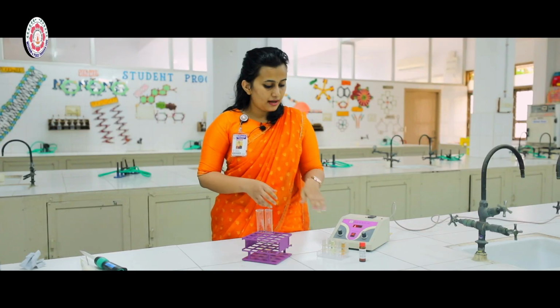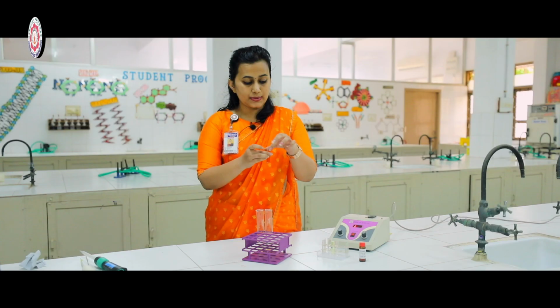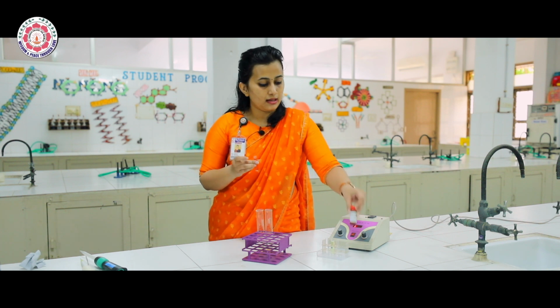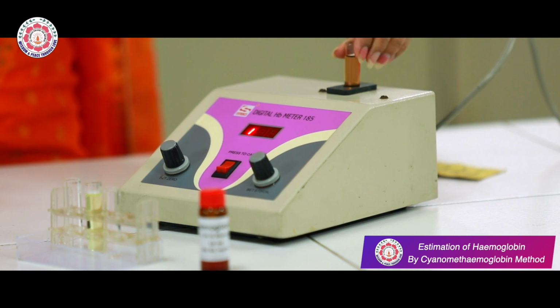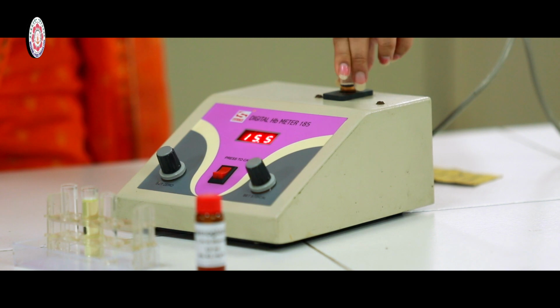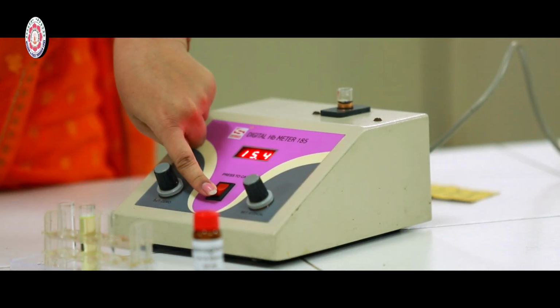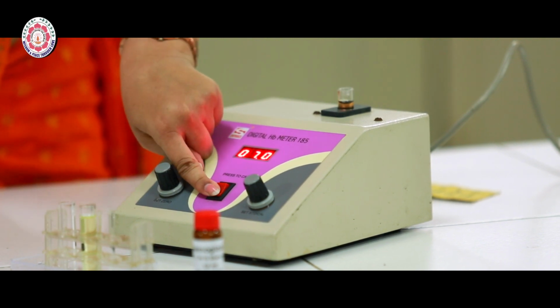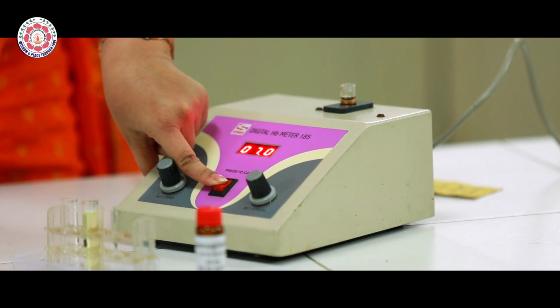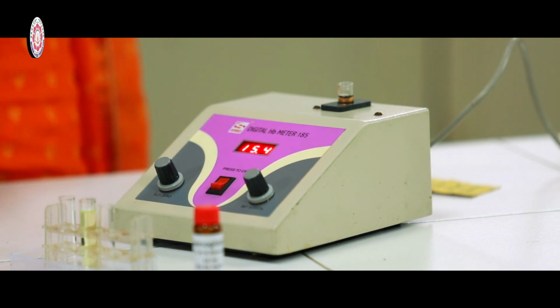In the next step, after the calibration is done with the blank, we take the standard hemoglobin. As you can see, it was taken from a chemically available or industrially available solution. We place that cuvette into the slot and we set the value. For calibration, we click this switch and at the same time we set it to 7. Once it is set to 7, it automatically comes to 15. This means that the instrument is calibrated.